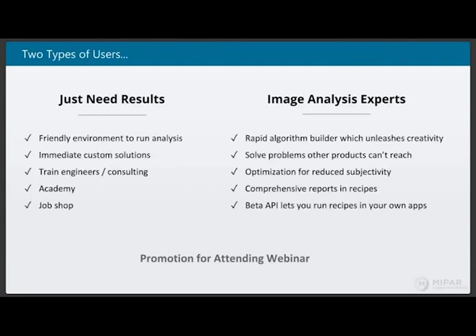Like I said, the color deconvolution tool can be of great assistance when it comes to separating features based on their color. Basically what it does is convert the color image into a grayscale representation of that specific color, instead of just separating the image into its red, blue, and green.